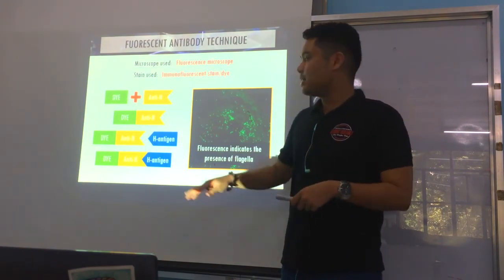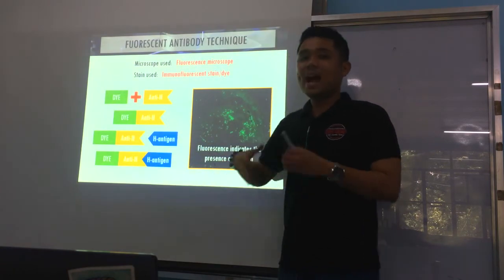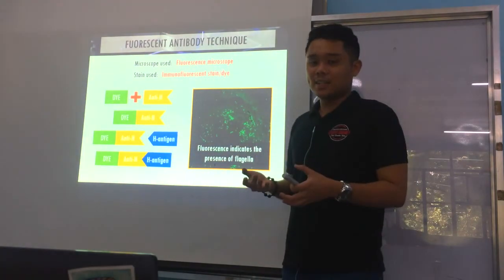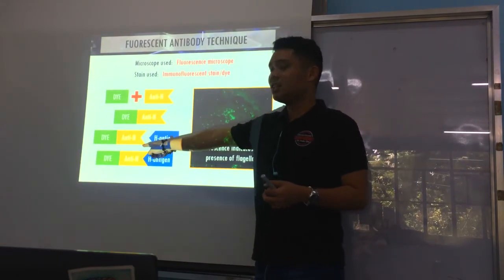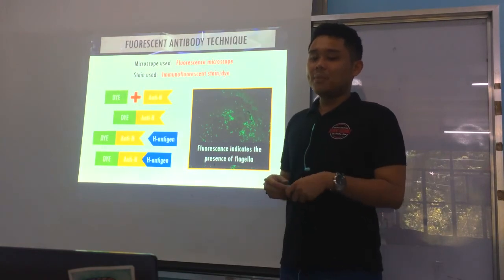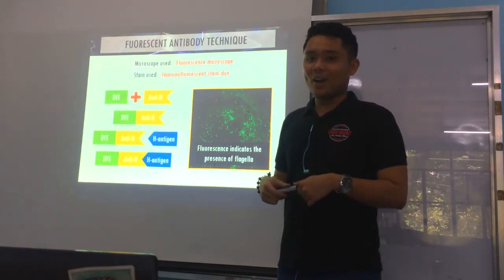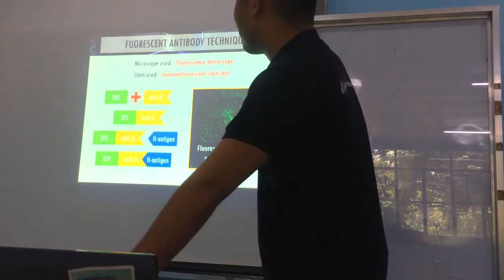Okay, gets lang? Since na may H antigen, they react as anti-H, okay, which trigger the dye to emit fluorescence. That's why na-color. But in the absence of H antigen, wala may mo react sa anti-H, wala yung reaction na mahitabo, therefore, ang dye, dili po ma-excite, dili po siya mo-emit o fluorescence light. Okay? Alright. That's for fluorescent antibody technique.